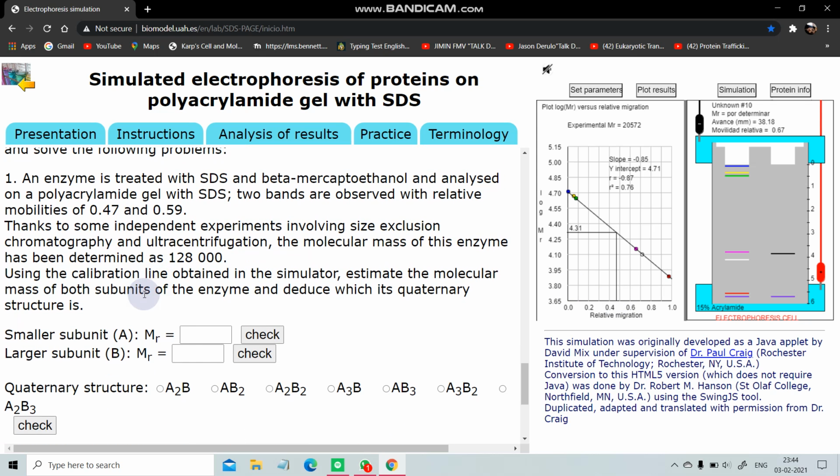So my value is coming out to be, just a second. This one is actually the smaller subunit, no? So I'll write 20572. Let me check. The answer is not correct. Answer is still not correct. Okay, no problem. I will try 2572. Let me check. The answer is still not correct. No problem. I'll just do it once more.